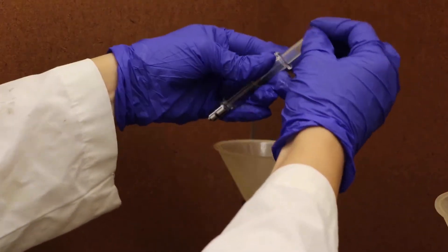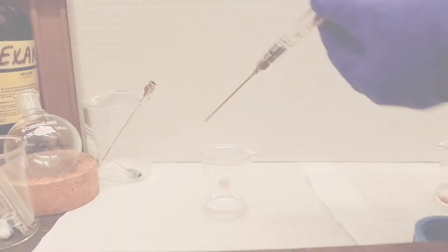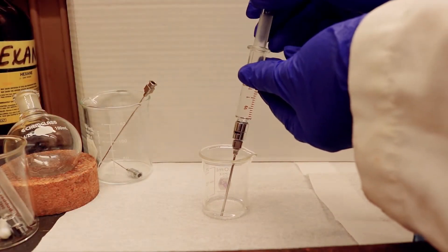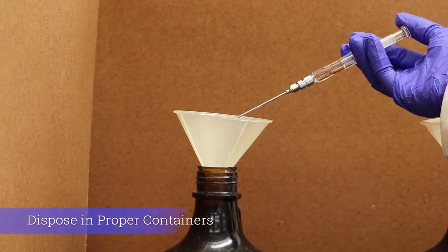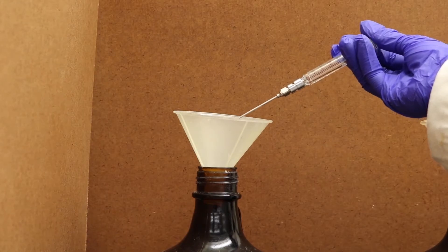In order to properly wash the needles, first assemble the syringe, draw the acetone into the needle, and dispose the washing agent into the non-halogenated waste. Repeat the previous steps 2-3 times.